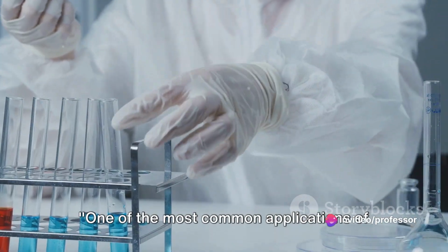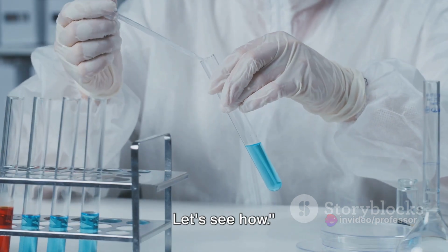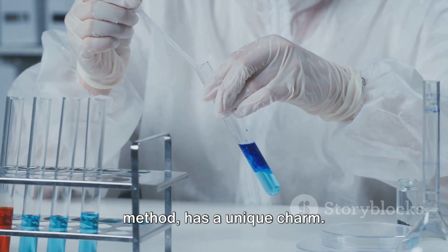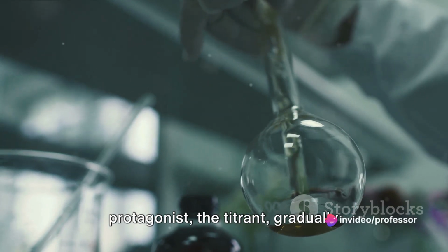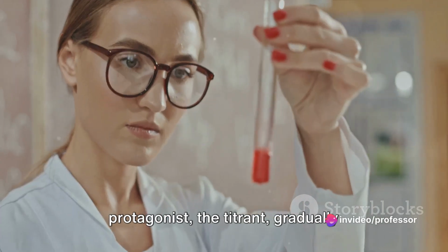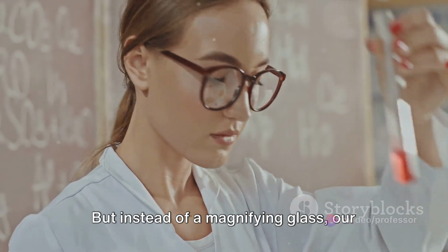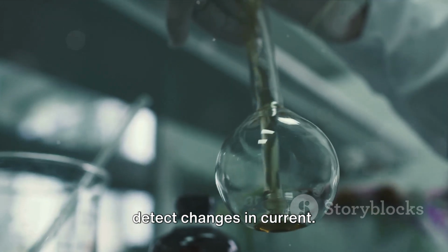One of the most common applications of amperometry is in titration. Let's see how. Amperometric titration, an analytical method, has a unique charm. It's like a detective story where our protagonist, the titrant, gradually reveals the secrets hidden in a solution. But instead of a magnifying glass, our detective uses a measuring instrument to detect changes in current.